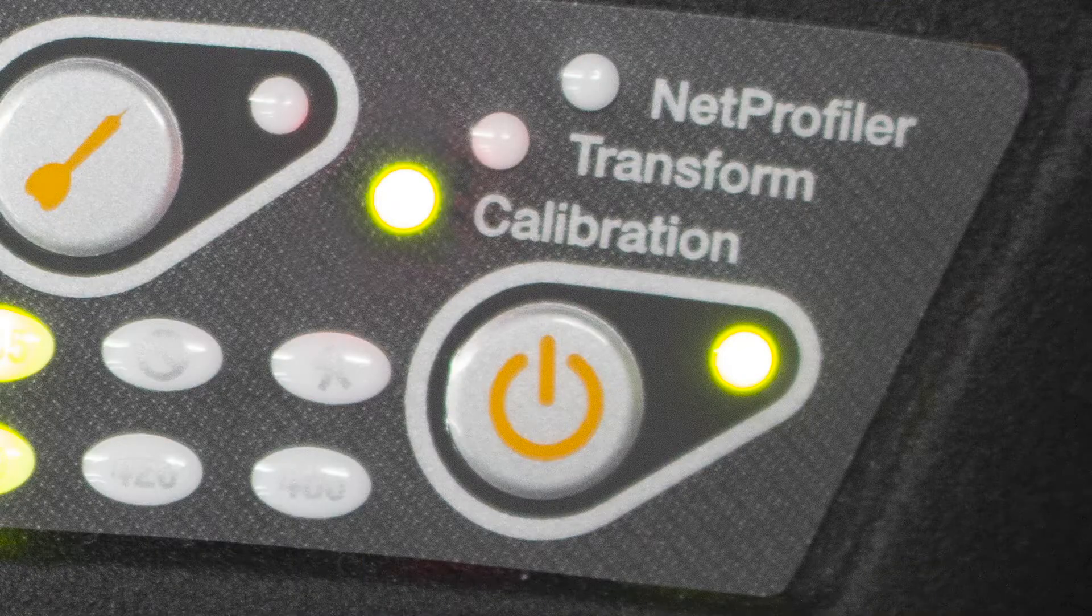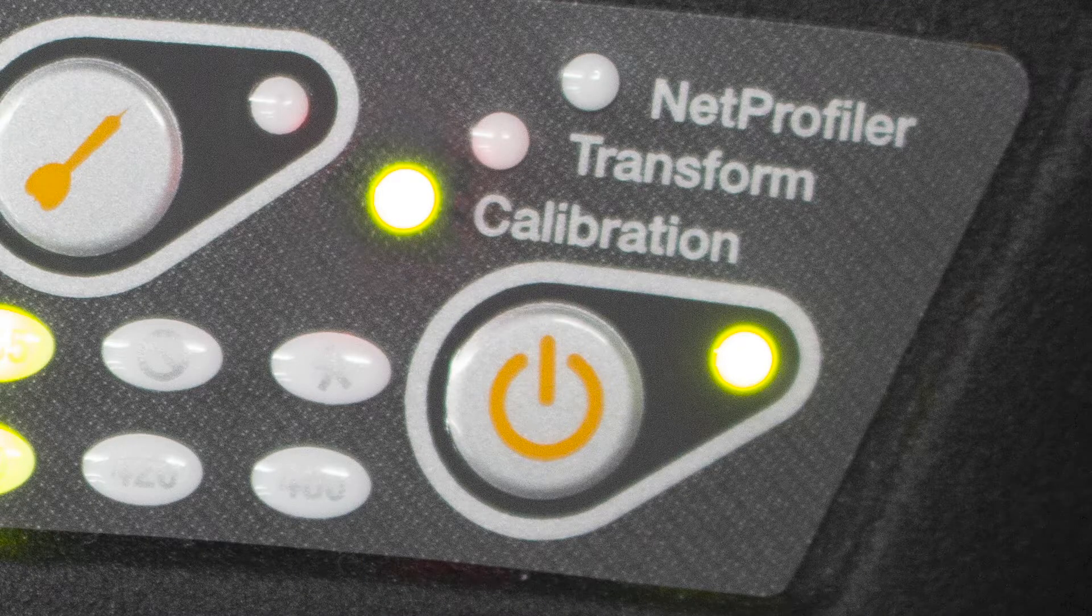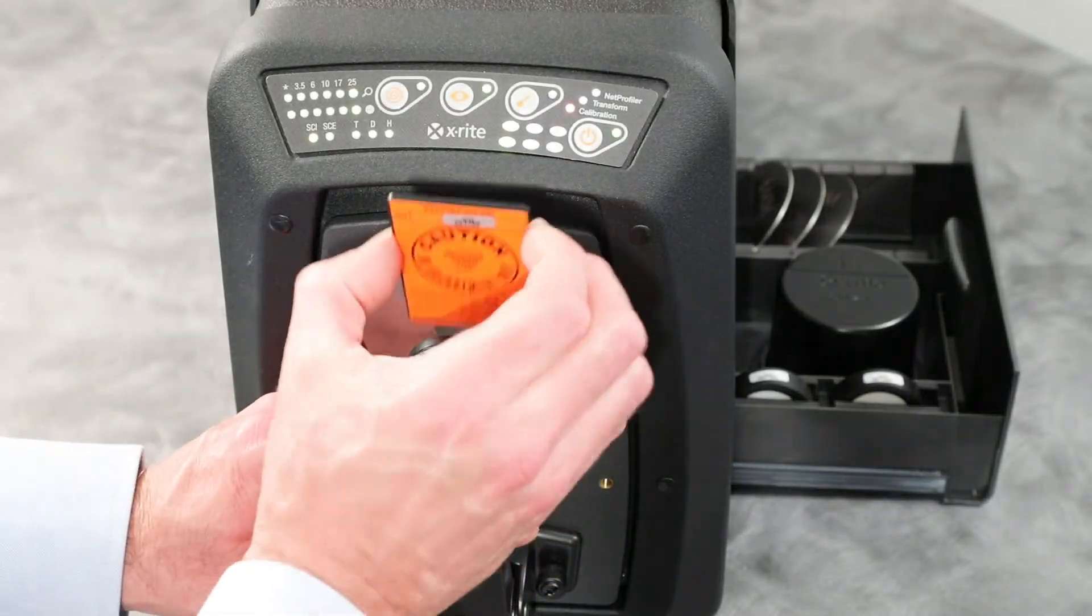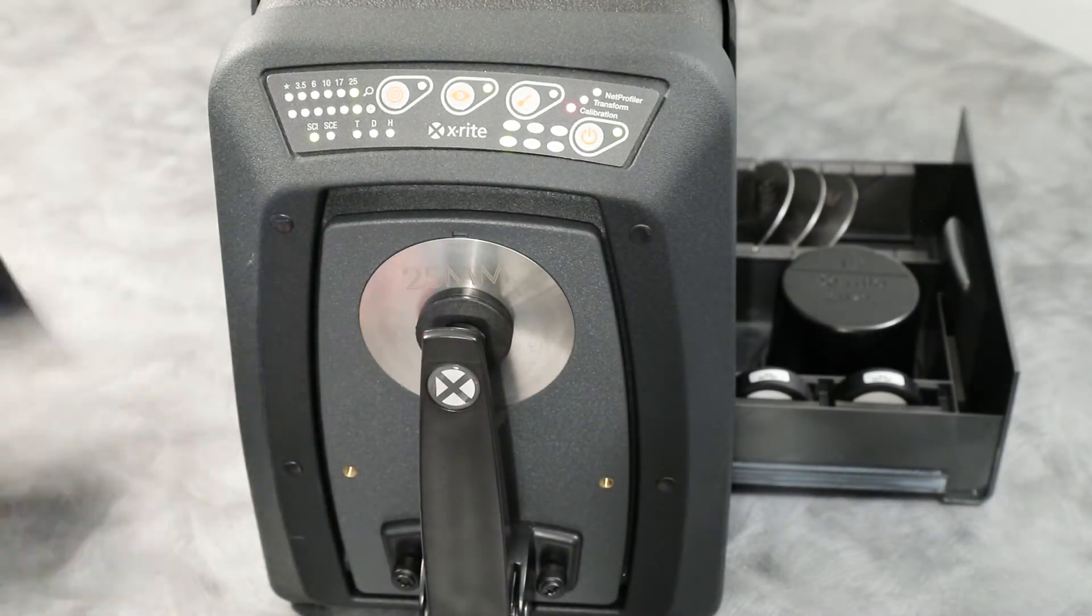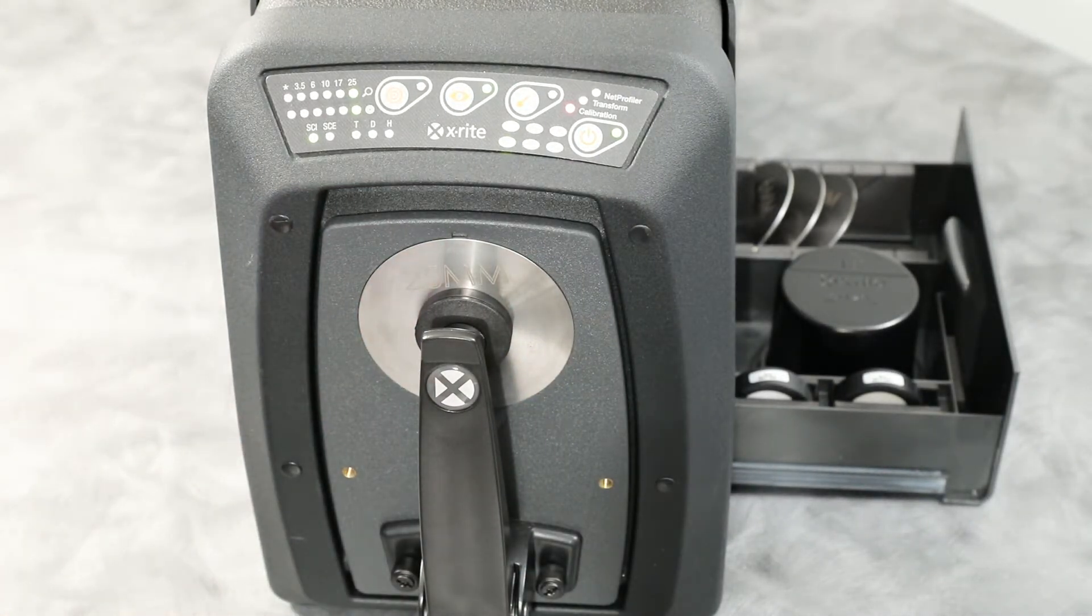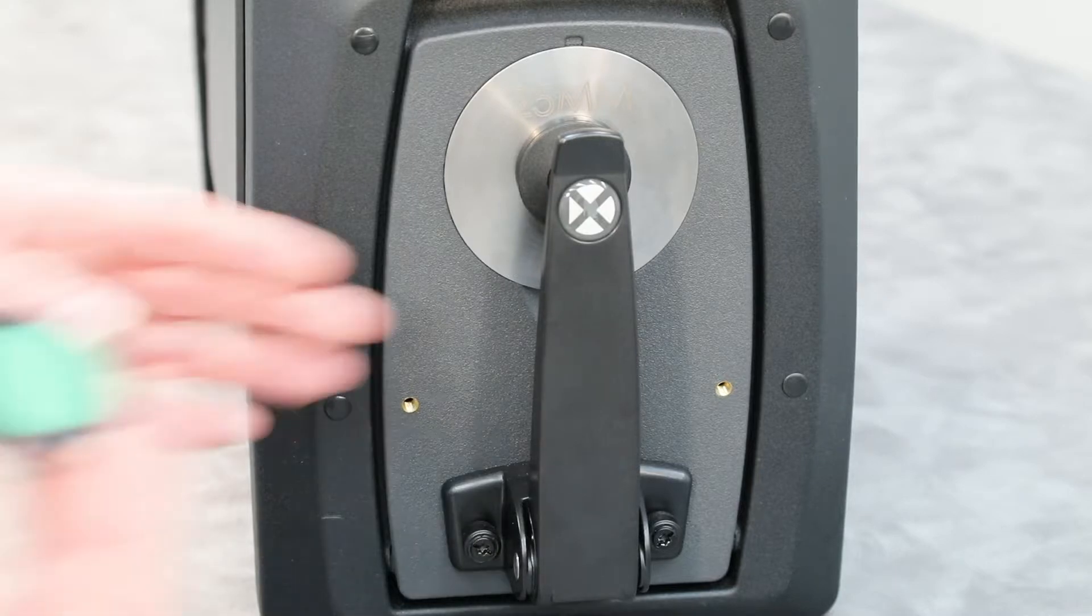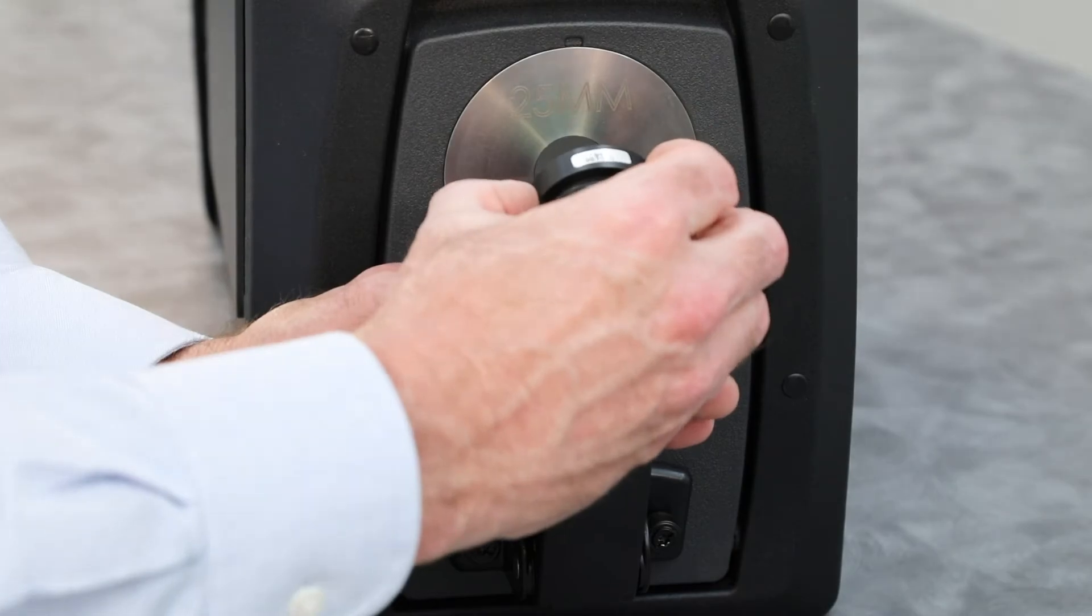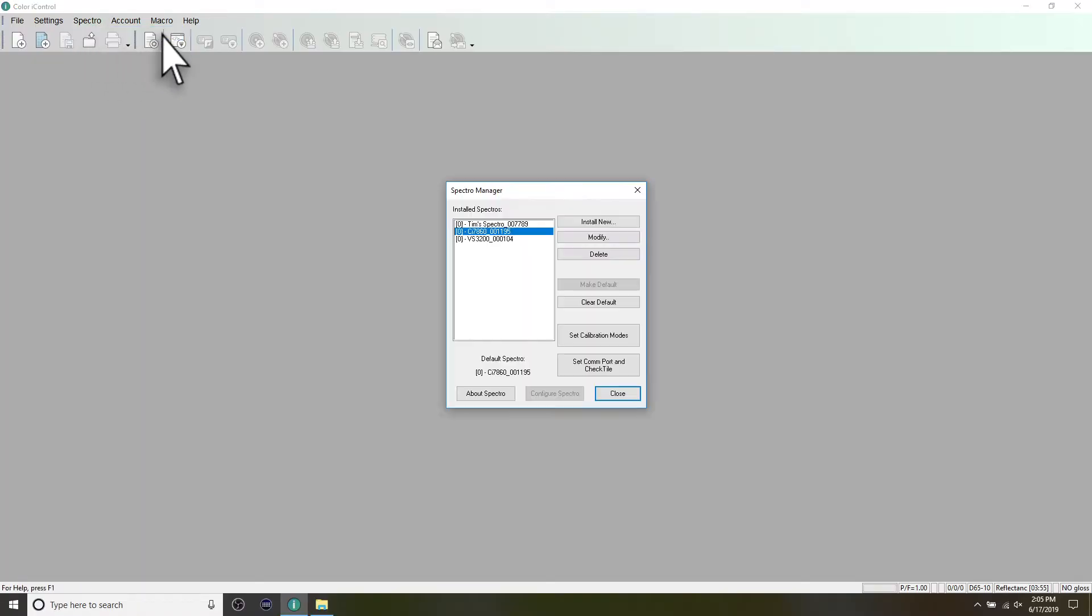The calibration light will appear green. Return the UV-calibration plaque back into its bag and return it to the drawer. Once calibration is complete, you can use the green check tile to verify the status of your instrument. This will first need to be enabled in your instrument's configuration settings.